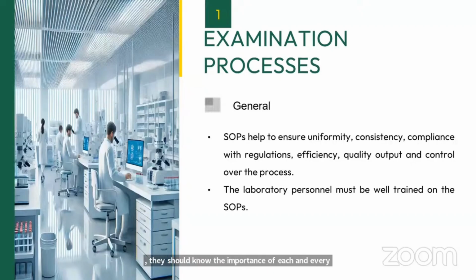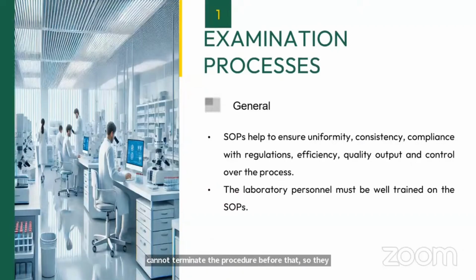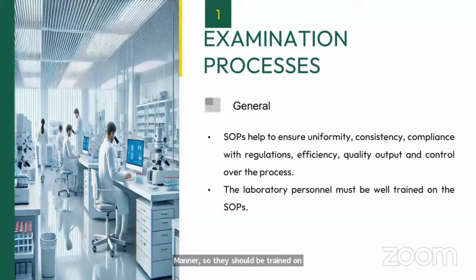Why they have to incubate for 10 minutes, why they cannot complete the examination in 5 minutes, or why they cannot terminate the procedure before that. They should know why it is important to incubate and wait for 10 or 15 minutes, and why it is necessary to perform each and every activity one after another in a step by step manner. So they should be trained on all the SOPs. They should know the importance of each and every step and activity of the SOP.